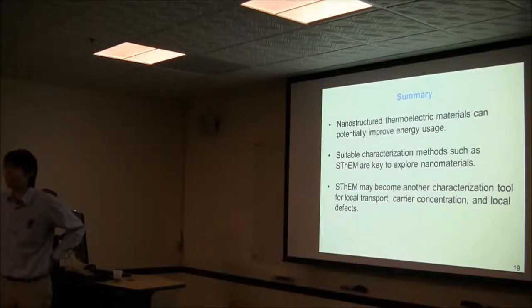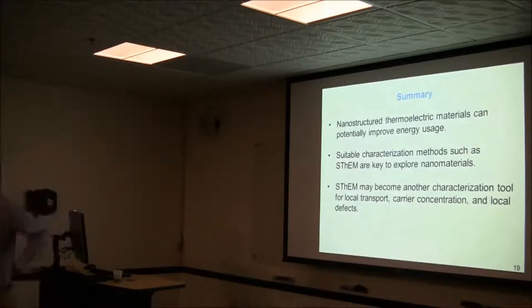I mean, comparing it to Hall effect, one of the nice things you can do with Hall is do it over a range of temperatures, and you can look at activation temperatures of different defects and stuff like that. If you, for example, cool the substrate, you could still do the same thing, right? There's no limitation in the temperature range you're working at?